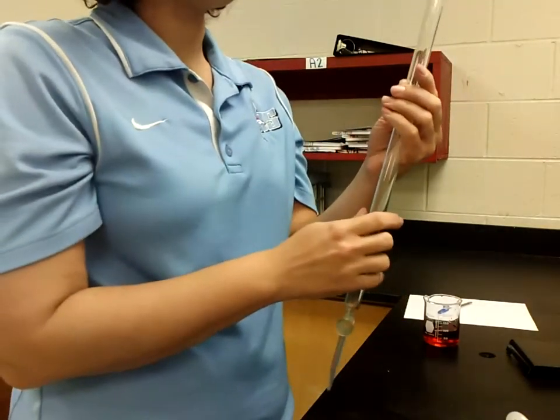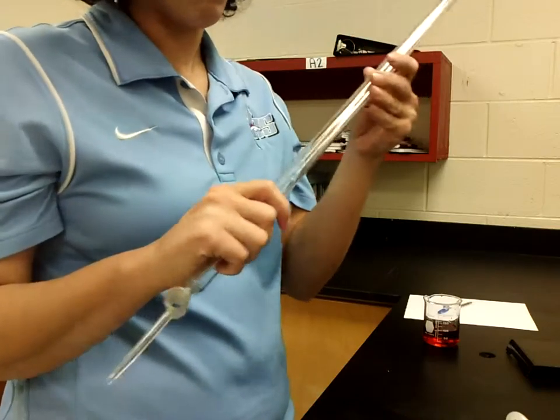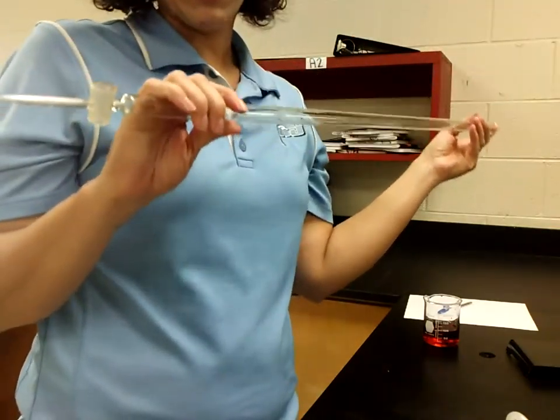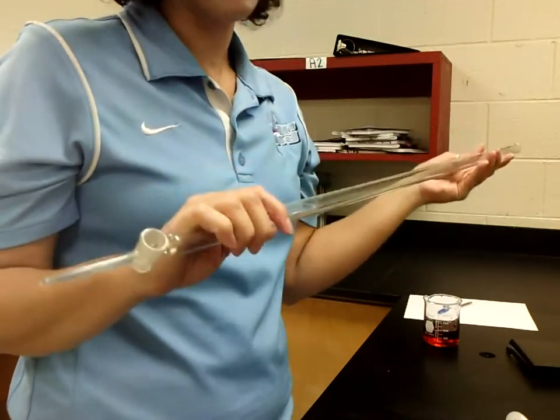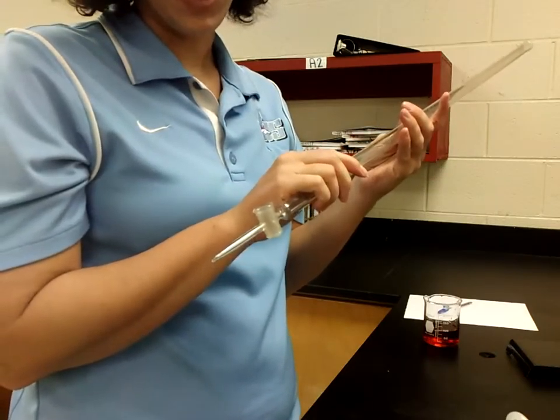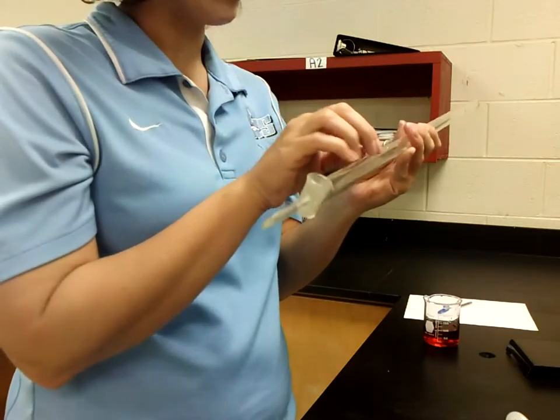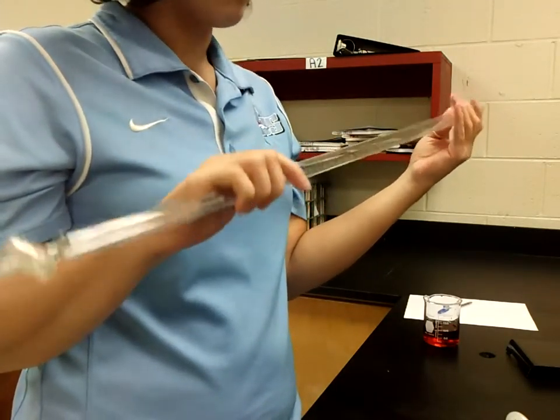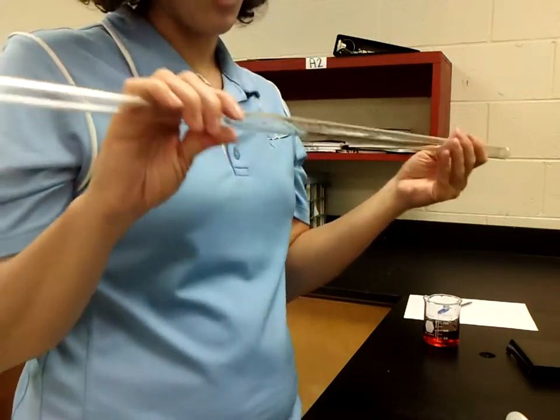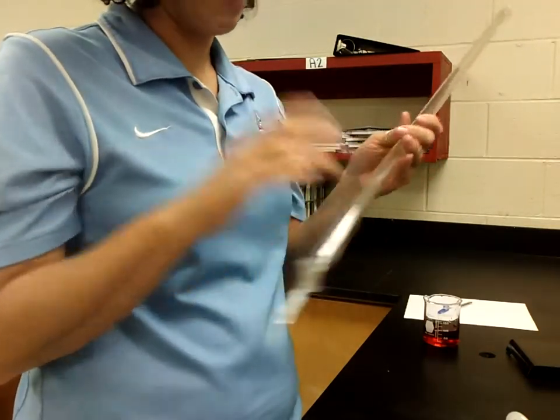There's a couple of important things you need to know about the burette before we start. The burette is very long, it's glass, it breaks very easily, so please don't drop them and be very gentle as you're working with it. This right here already has cracks on the end, so you guys probably will not be using that. Remember to check for cracks as you look over it. Make sure that you grab one that I specify to make sure they're clean.